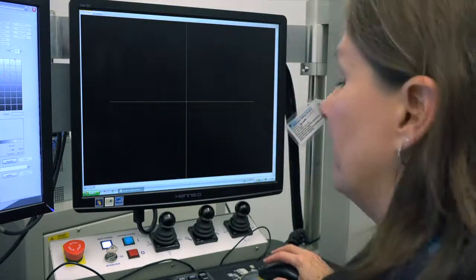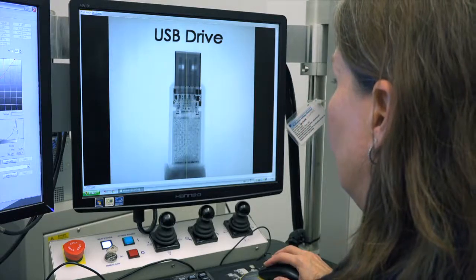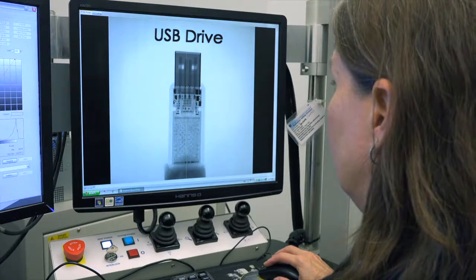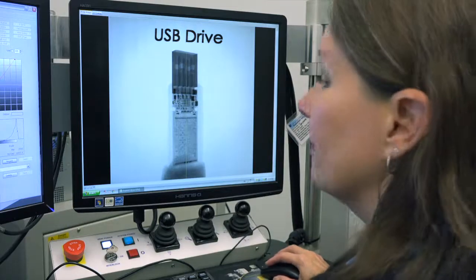Darker areas in the image are where x-rays are absorbed by the dense areas of the sample. Brighter areas indicate regions where the x-rays pass through the sample.